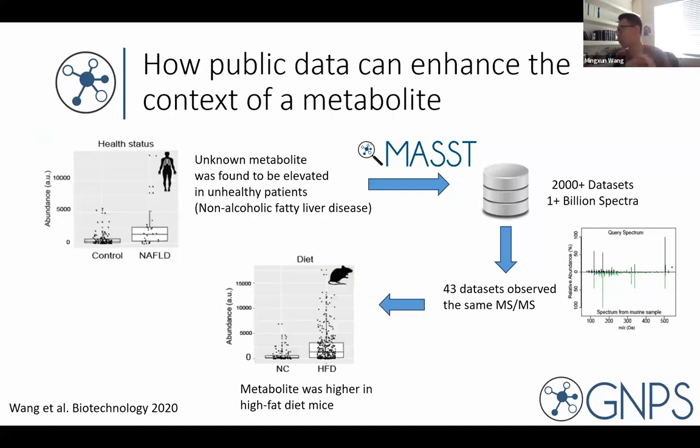Again, this won't be perfect for all situations because there are differences in how people run mass spectrometers. You might not find the same molecule in others if you're tuning your mass spectrometer in a unique way. But if we're all getting to a place where our tandem mass spectra are tuned reasonably similarly, this might be an avenue to explore.